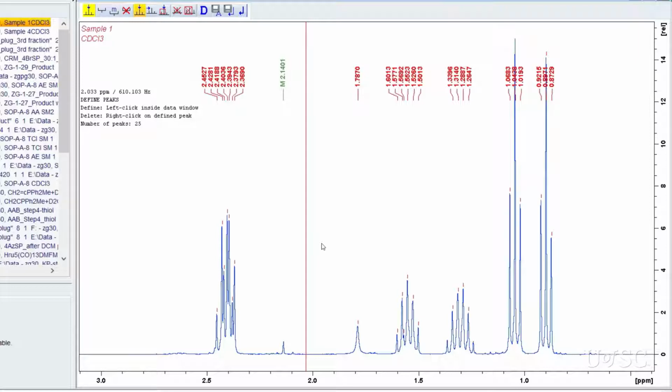Note that the peak is labeled in green with M in front of the value. This shows that the peak was selected manually. This distinction will not show up in plots and the manual peaks will blend right in with the peaks picked with PPS, or the other tools in manual mode. You can choose as many peaks as you need with the tool.